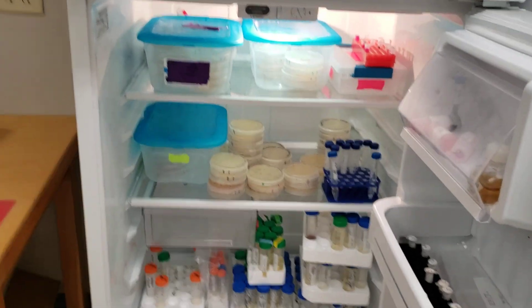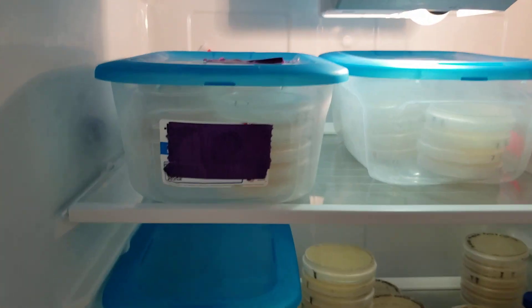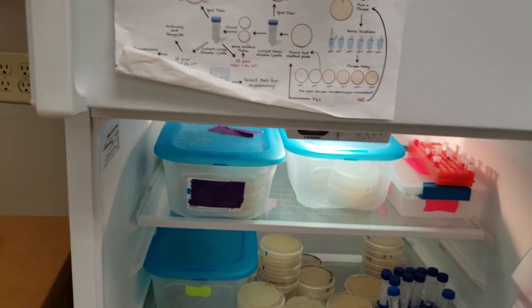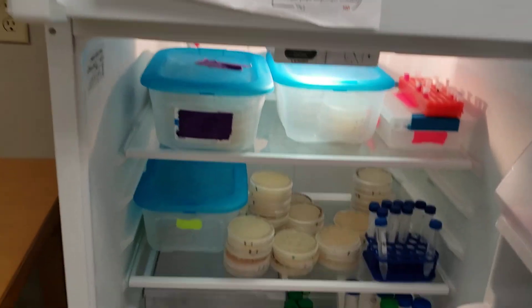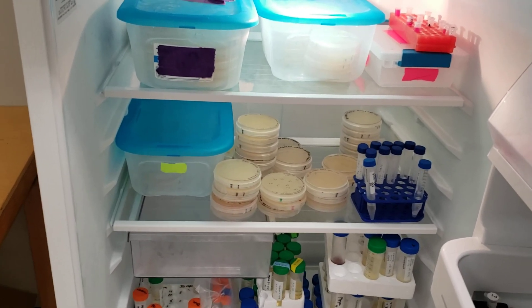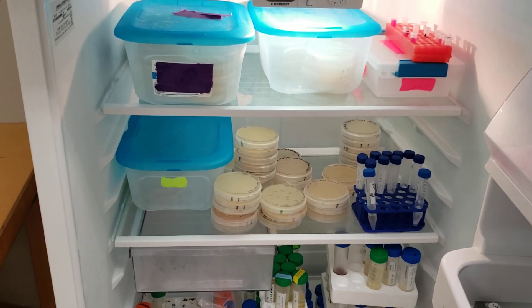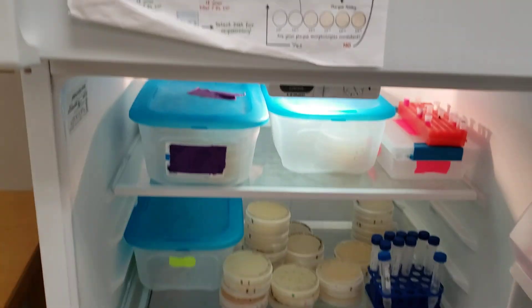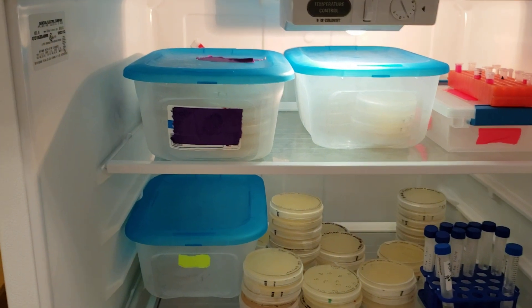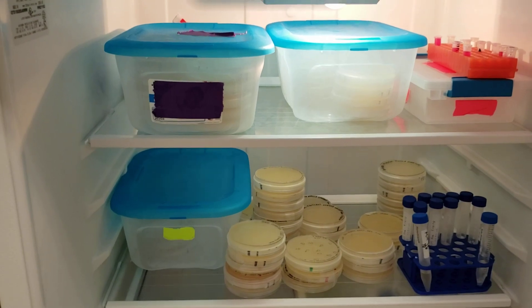In the refrigerator below, students store their plates. Only things stored in boxes are kept — I throw away any plates left outside of a box. Because of COVID-19 we stopped mid-semester and some plates didn't get moved into the class box, but normally this is how we keep things organized. If a student's box gets full, they have to decide what to keep and what to throw away.